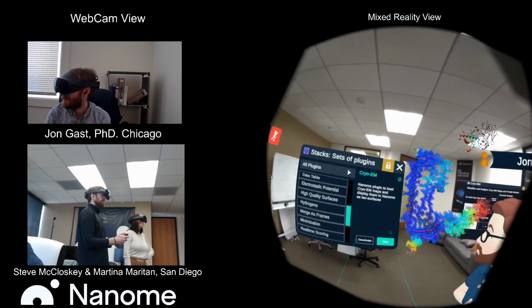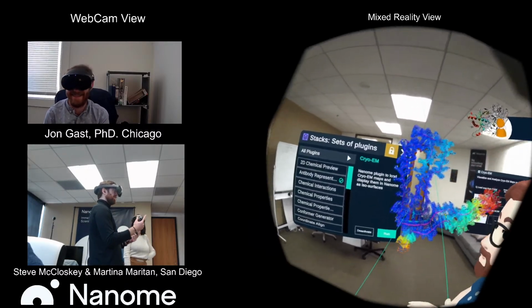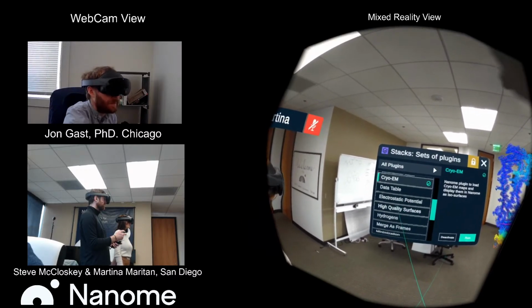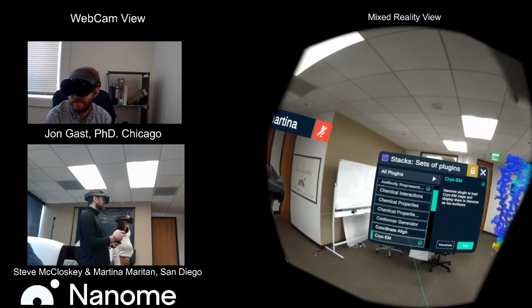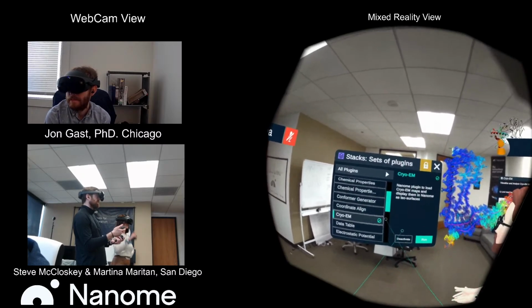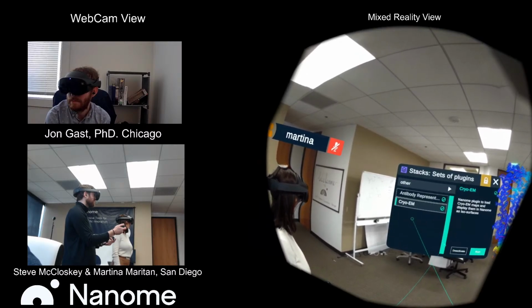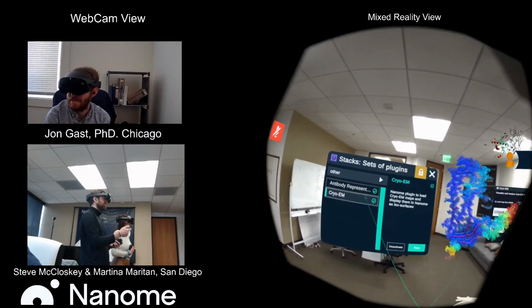And I'm just going to pull up the Nanome Stacks menu in general because that was a high level philosophical question as well. The reason why we have plugins has a lot to do with standalone headsets. There are many types of calculations that we have plugins for: energy minimization, docking, superimposing structures, data tables, and vault, which is data storage that's persistent across sessions so that you could be pulling files from a stable place. The new ones, which we have listed as other but should probably be in the structural biology stack, are the antibody representation and cryo-EM.